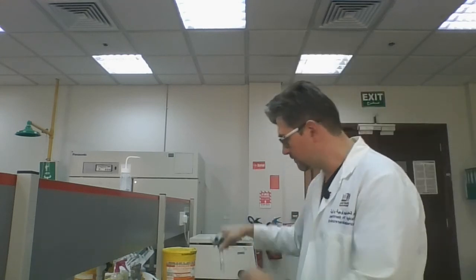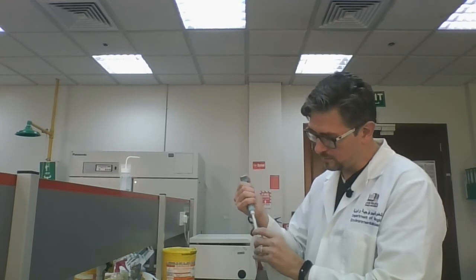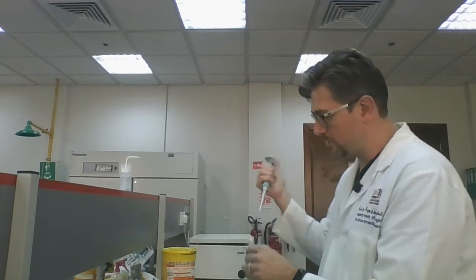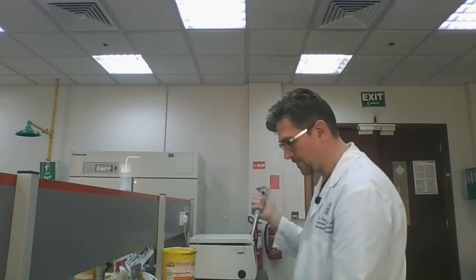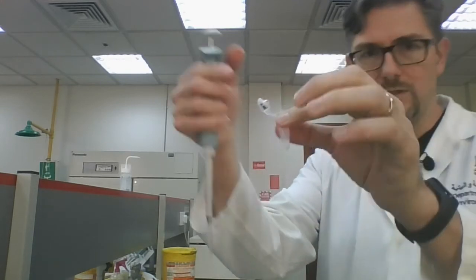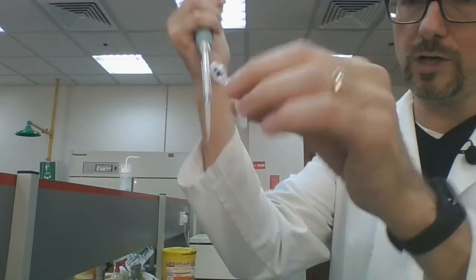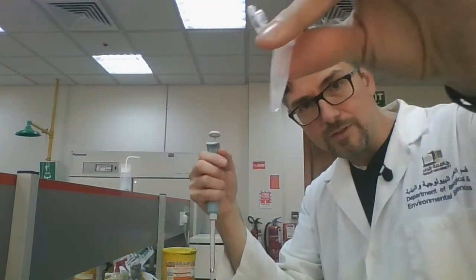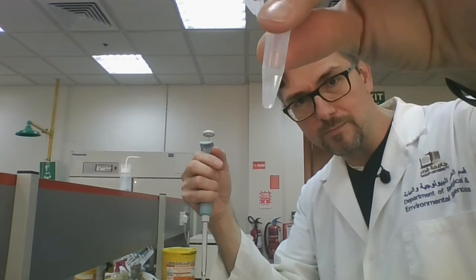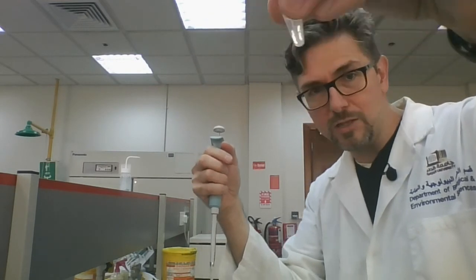One of the things that you will notice, at least hopefully what you will notice, is that your solutions will become clear when you add this. So I'm going to hopefully let you see this. So again, we have a cloudy solution to start with, and this is going to help to lyse our cells. And so you can see that the solution is becoming clear after the addition of NaOH and SDS. And again, that's just because what we have here is cell lysis, and so those cells are no longer in place. They're no longer able to block light.